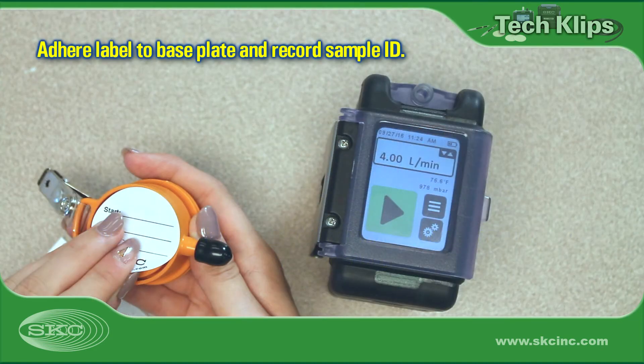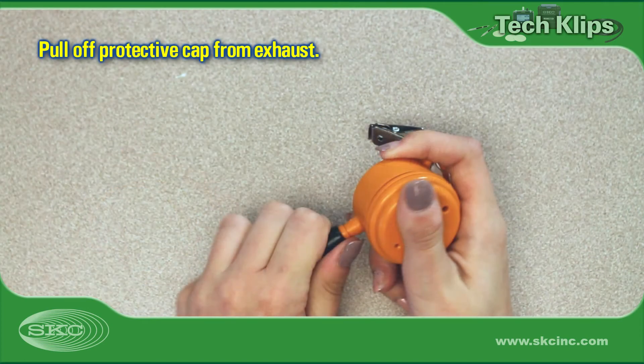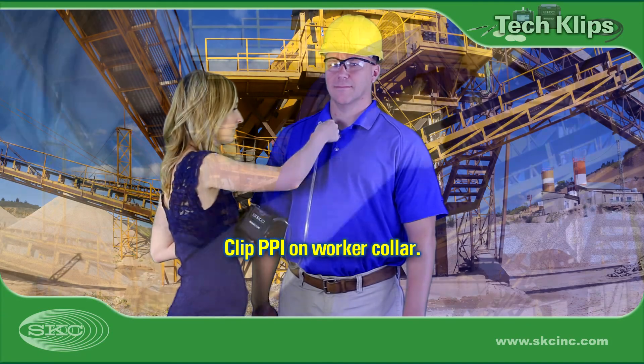Adhere the provided label to the bottom of the sampler's base plate and record the sample ID. Record the sample start time on this label when ready to sample. Remove the protective cap from the sampler exhaust. Attach the pump inlet to the PPI exhaust with Tygon tubing. The tubing should be long enough to reach from the worker's collar to waist.